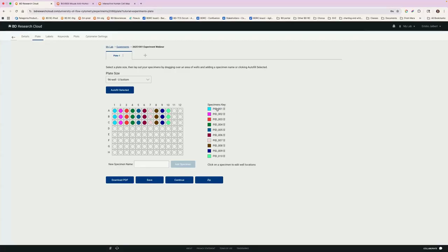I can always edit any one of them by clicking and updating the name, or just keeping it the original name. Doesn't matter. If you have complex names for the specimens, I recommend that you just leave the default name and in the keywords, you can copy and paste those specimen names. We're definitely going to go through that in just a little bit. So for now, if these are just generic, let's say here we can delete them, even if I didn't add a prefix.